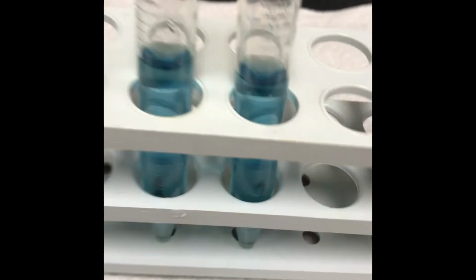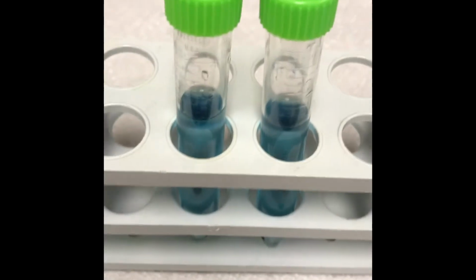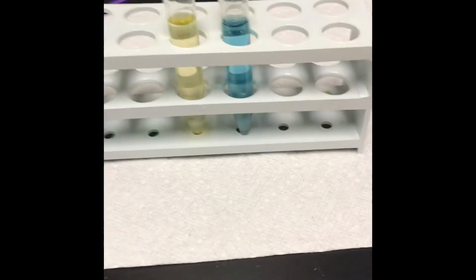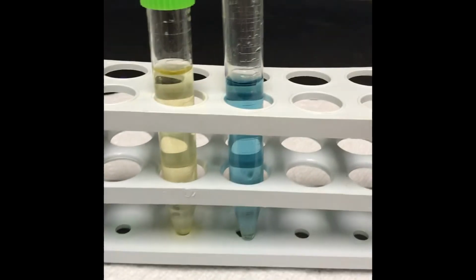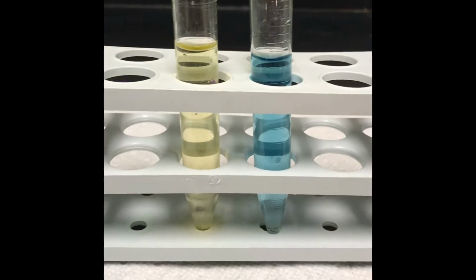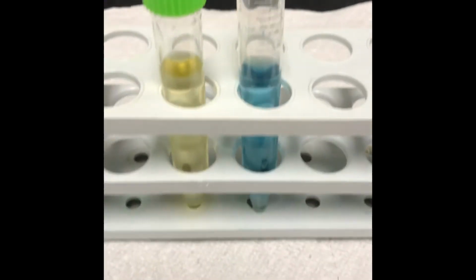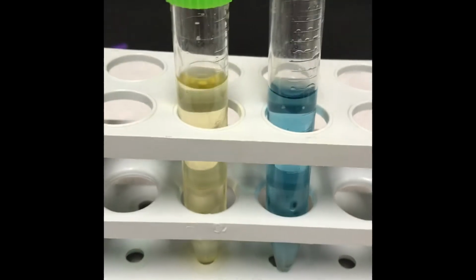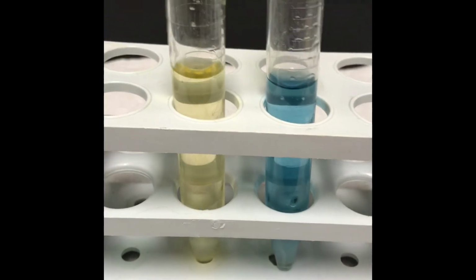So right now, you can see both tubes are blue, right? There is no carbon dioxide present because the color is blue. So here we go. I'm going to change the color. Check out my amazing skills, my straw ability. Isn't that cool? So now tube A, you can see it's changed. So you want to record this in your data table. Put after blowing, note the color.